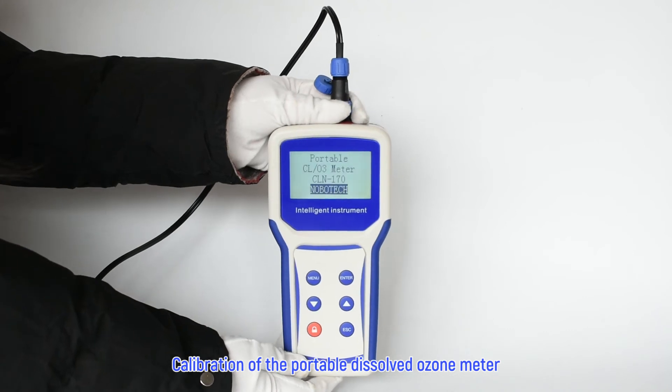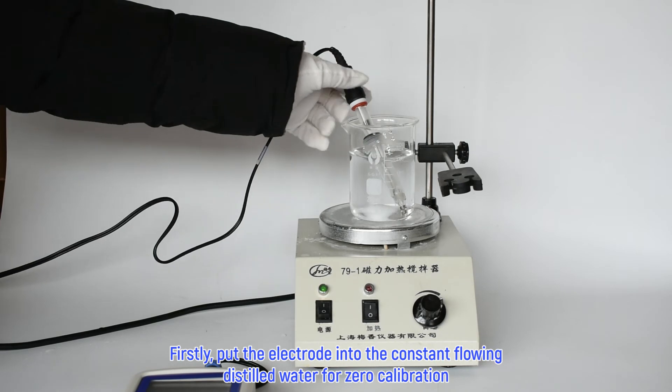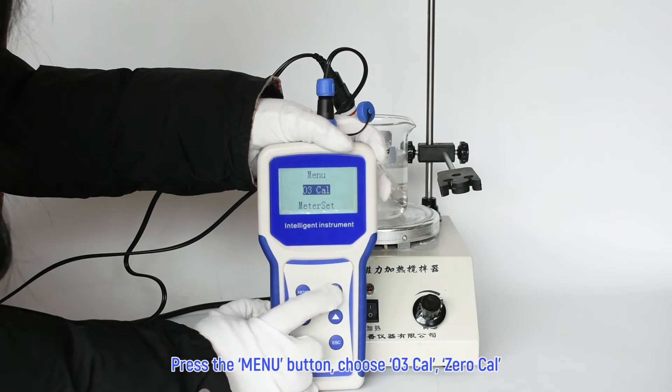Calibration of the Portable Dissolved Ozone Meter. Firstly, put the electrode into the constant flowing distilled water for zero calibration. Press the menu button, choose ozone cal, then zero cal.